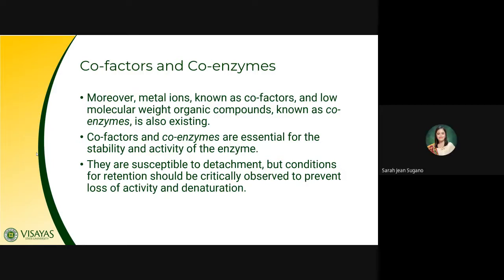As you can see, class, in the components of PCR, the cofactor is already there, the magnesium chloride. So you have your template, magnesium chloride, the buffer, and also the dNTPs, which are your nucleotides, and also your primers. But what I'm trying to say is that the magnesium chloride, which is the Mg2+, is your cofactor that helps your Taq polymerase to function in synthesizing the new strand of DNA, the complementary strand of the single-stranded DNA.